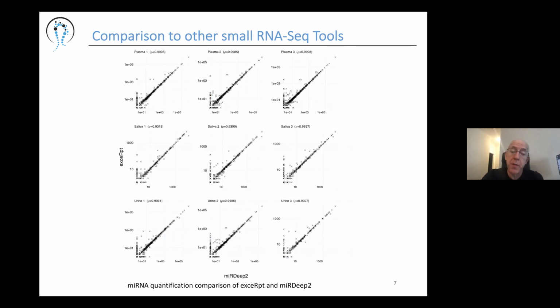There are other tools for analyzing small RNA-seq data, such as miRDeep. And in the paper, we correlate the quantifications of microRNAs between our exceRpt pipeline and miRDeep, and we get very high concordance.